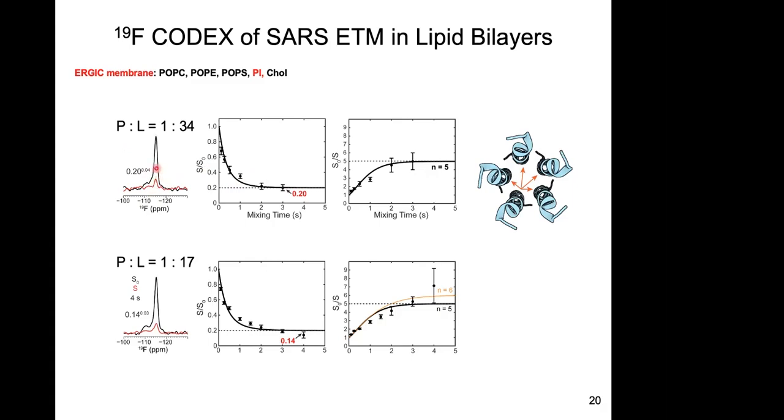And how much lower, you look at the intensity, in this case it's 0.2, with a certain error bar. So you see that, okay, in the end, when everything is equilibrated, I have a 1/5. In other words, I have a pentamer for this membrane peptide. And I care to know this because in the literature, people debate whether this peptide makes a pentameric channel or who knows, tetramer or hexamer. So that's the kind of question I can answer.